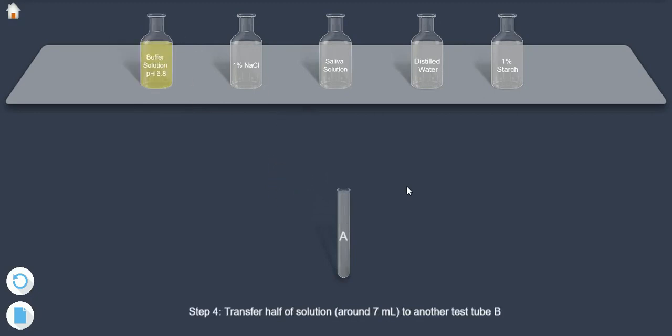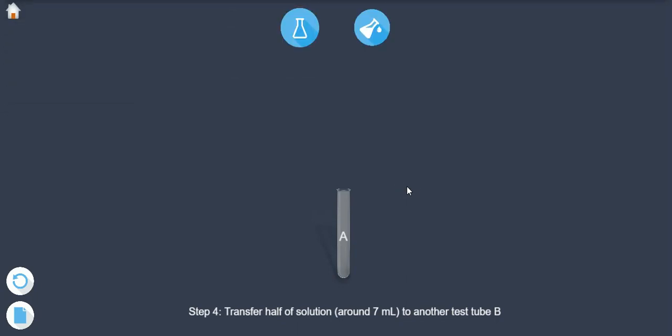Step 4: Transfer half of solution, i.e., around 7 ml, to another test tube B.